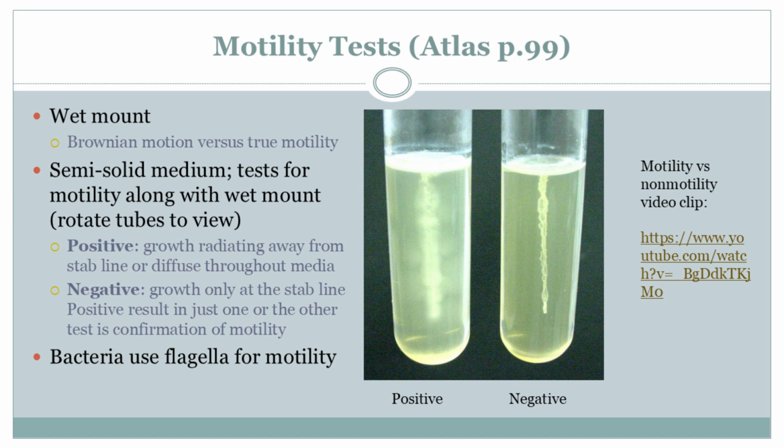Right. Now, on the flip side, imagine a bacterium that's not exactly winning any races. Watching them in a wet mount would be like watching grass grow. Ugh, yeah, I got better things to do with my time. Exactly. But with the semi-solid medium test, we can just let them hang out and see if they've moved at all after a while. It's a more relaxed approach. I love it. We're giving these little guys their moment to shine, no matter their pace.